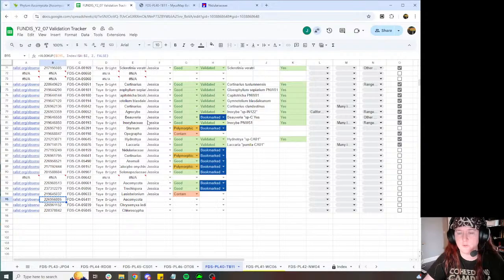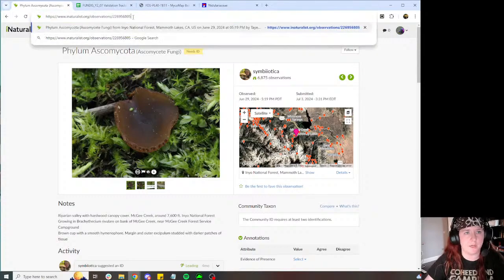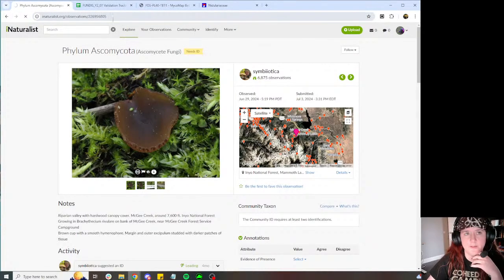Basically, we use nanopore, so Oxford Nanopore Technologies, to sequence everything. And so basically we sequence like 500 mushrooms at a time, a little less.